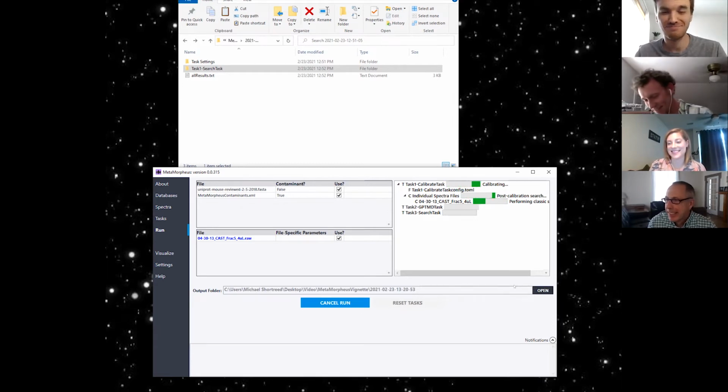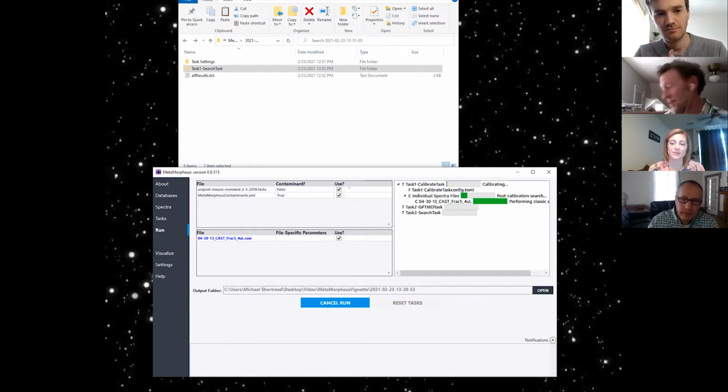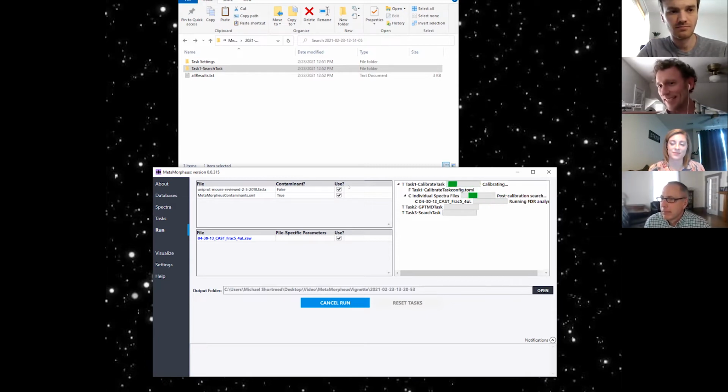All right. I have one technical question and then one bigger question. So is it every time you run the calibration task, you're going to get file-specific parameters? Let's just hypothetically say I had 35 different instruments running a sample, all raw files. I could throw those in here. I would still have to fill things out, but with the calibration, each file would then, let's say this person's running an Orbitrap, or this person's running a TIMS, whatever, it would go through and give me different settings. Yep. Okay, that is crazy.